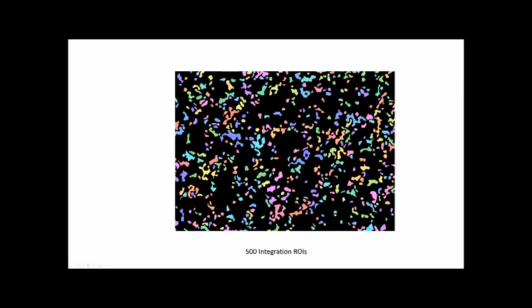Integration regions of interest are sets of pixels that we expect to fluctuate in brightness as a unit, like the pixels that correspond to a given neuron or a given synapse. We've already talked a little bit about how analysis works for calcium imaging data. Generally, we want to combine photons coming from a set of pixels in space. That's done post hoc in analysis, after each of those individual pixels was measured separately. But we can really speed things up by combining that information at acquisition time, by illuminating those pixels at the same time. That's a very powerful approach that's available with this method.